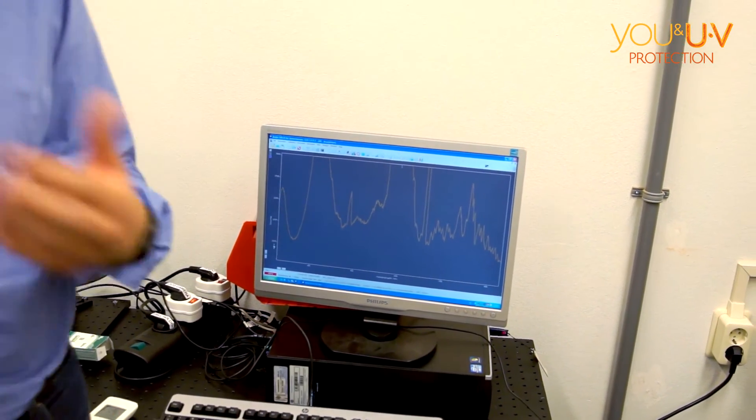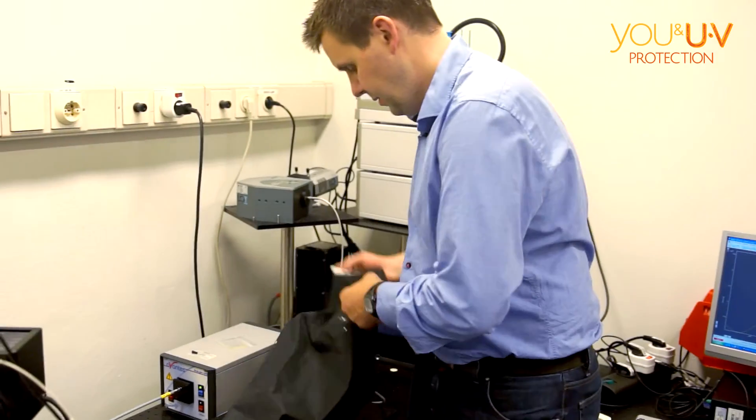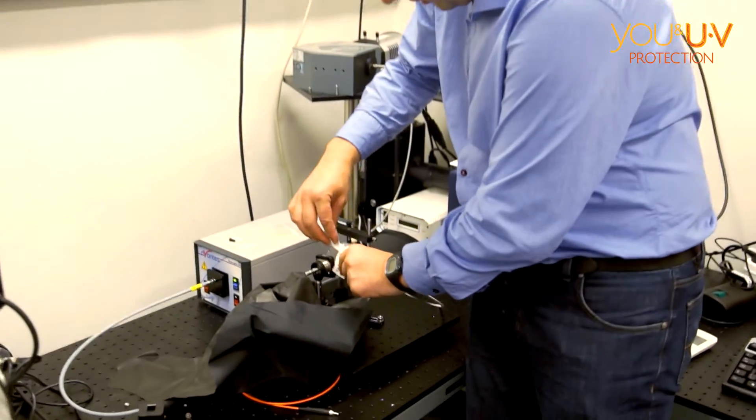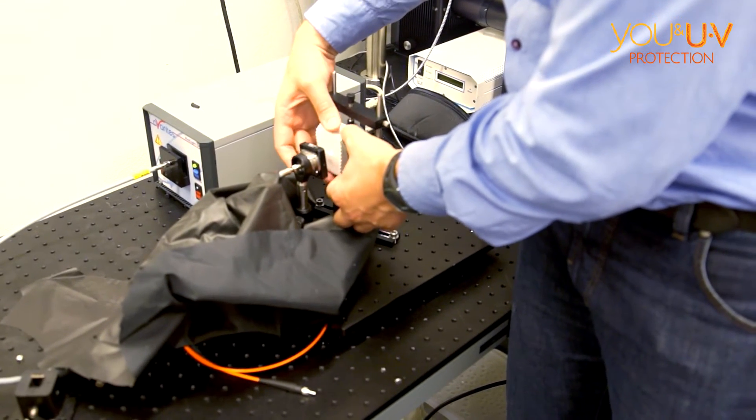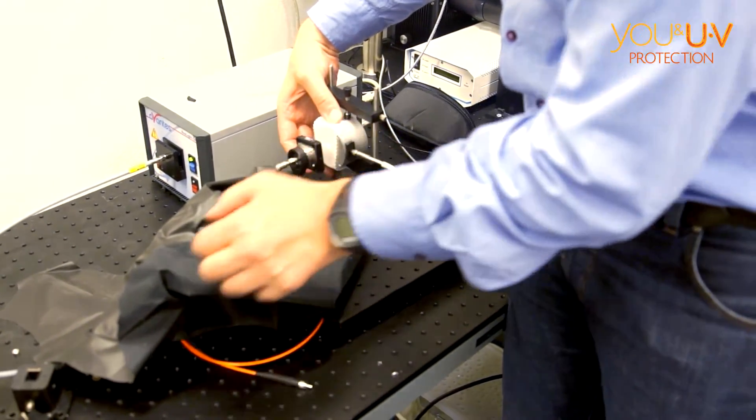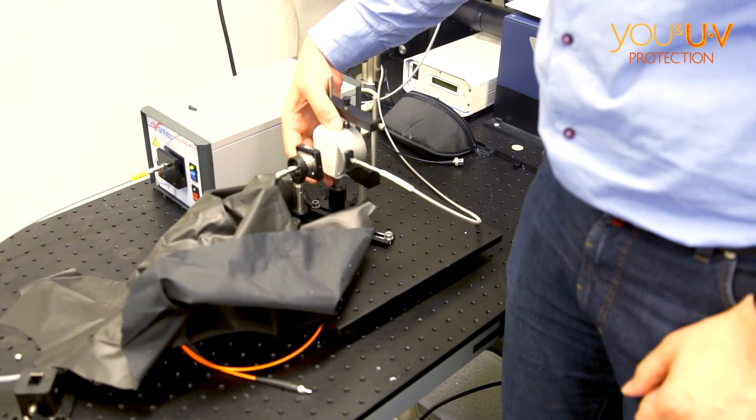It takes a while for the deuterium lamp to warm up. We put the cloth in the way of the beam, and we want to pin it down quite close. It's handier when it's horizontal, you can pin it.